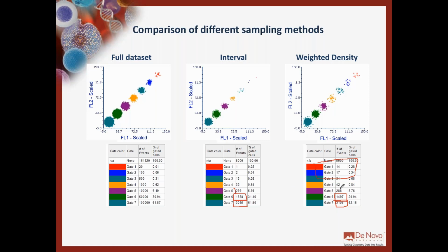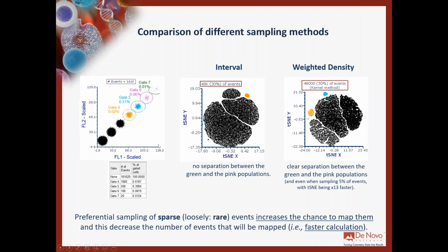Instead of 300, it's 288. So you're losing a little bit of information here, but you're gaining a lot of information here. And this means that tSNE and UMAP and FlowSOM and whatever will access more information. So this is what I've done.